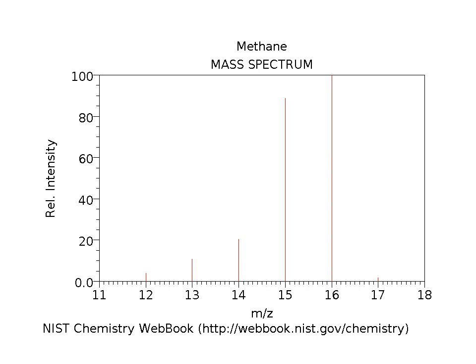Here we have the mass spectrum of methane. At mass-to-charge ratio of 16, we have the molecular ion, where we have carbon as the 12 isotope, the most abundant isotope of carbon. And right next to that at 17 we have the M+1 peak with the carbon-13 isotope. Then below 16 we have one major fragment, which is for CH3+, and that's again with the carbon-12 isotope. There are a few other fragments with lower mass-to-charge ratios, but they're less common. This would be due to the loss of hydrogen atoms from CH3+.